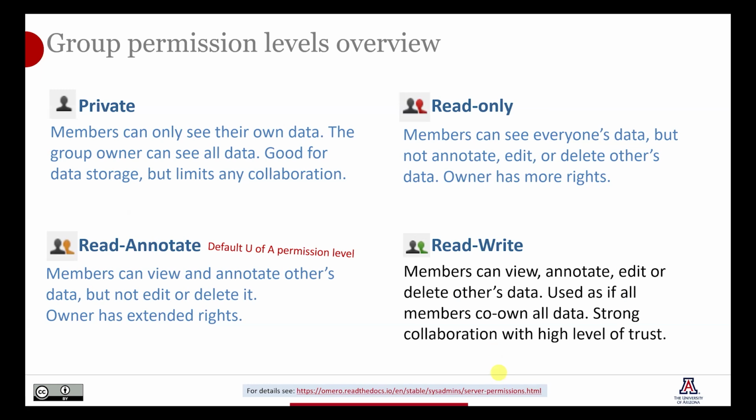Now, this is used as if all the members co-own all the data, and that's a strong level of collaboration with also a very high level of trust. And that can only be granted by an administrator. So let's take a little bit deeper look at these permission levels.